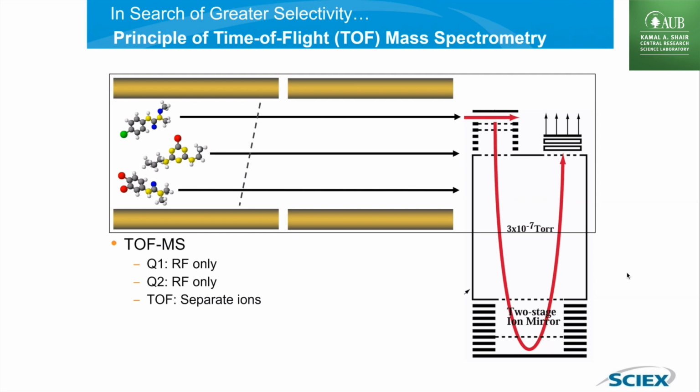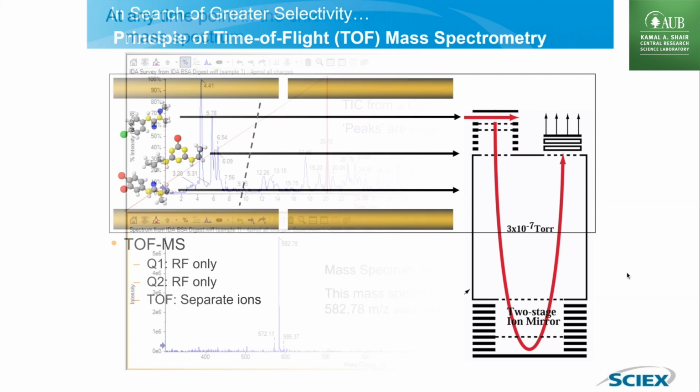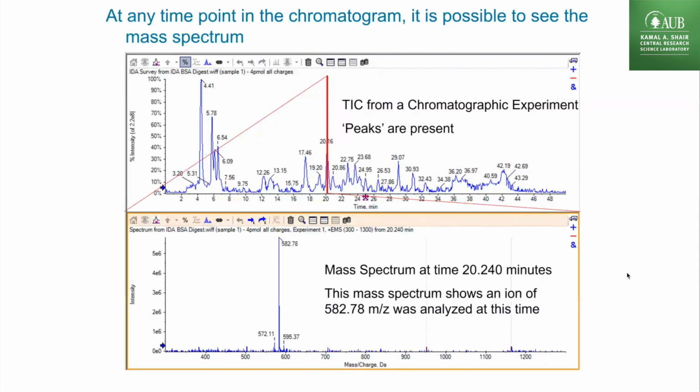So you will be presented first with the chromatogram. And the other axis of the chromatogram will be the intensity. So here's our first chromatogram on the top. Here we have intensity on the y-axis, and here we have time. So this is a chromatogram from an experiment done in a MS scan, what we just talked about in full scan. And you see all these different peaks coming out. Those are all the different compounds that have been measured.